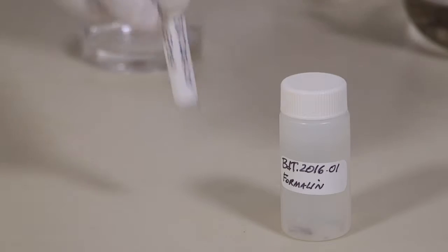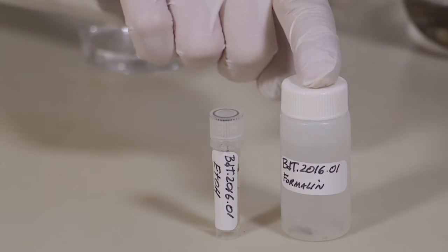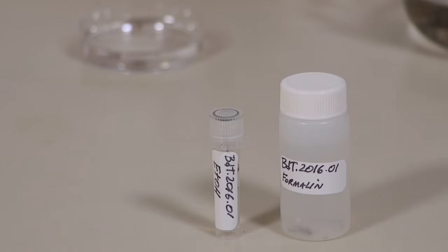I suggest you prepare two vials for each species you collect: one in formalin for morphological analysis and to identify the species, and one in ethanol for molecular analysis.